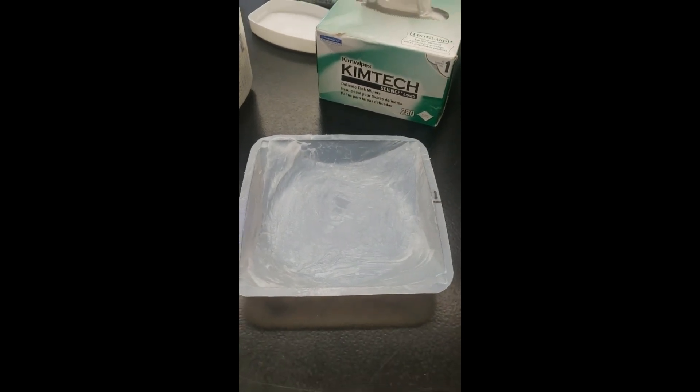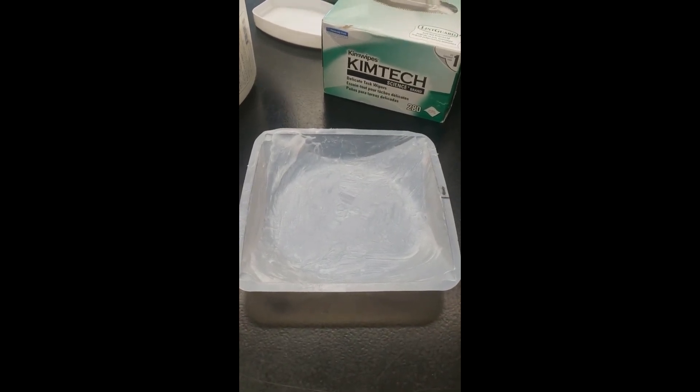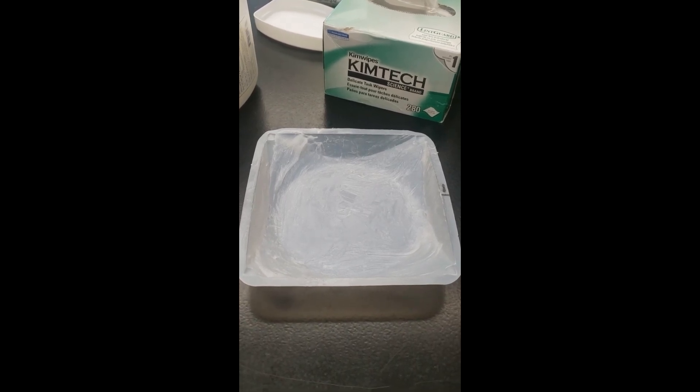That's what it should look like — petroleum jelly with a number on the dish. Make up as many dishes as you make containers for your yard.